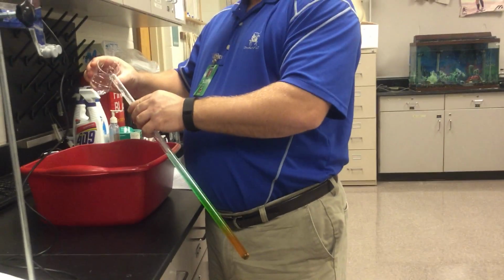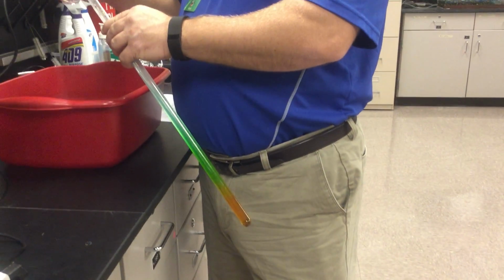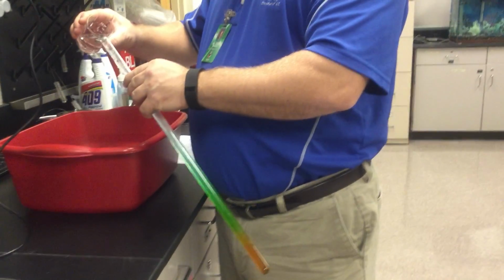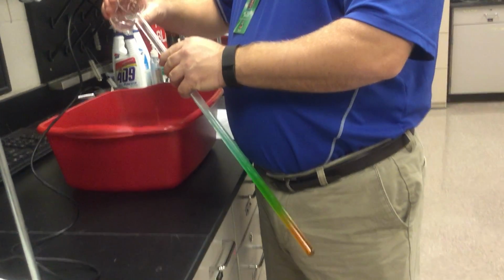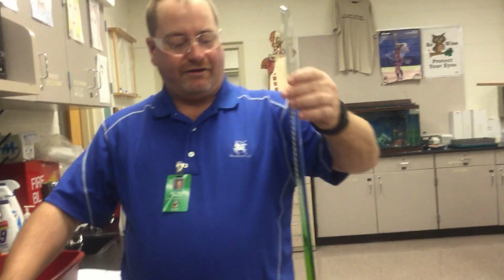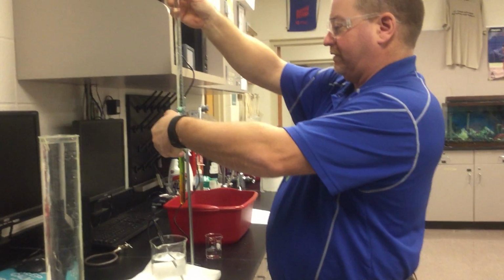So Kyle, are you getting a pretty good shot of that? The coloring, how it's looking? And folks, are you noticing the coloring? I'm going to fill it almost all the way to the top, which I have here. Okay, and notice how it looks. Now I'm going to set that here for a second, just put it into my burette clamp, which is what this is called.